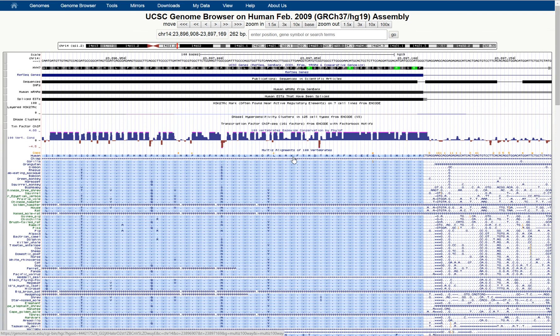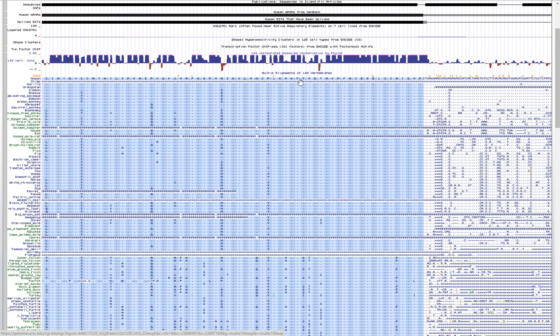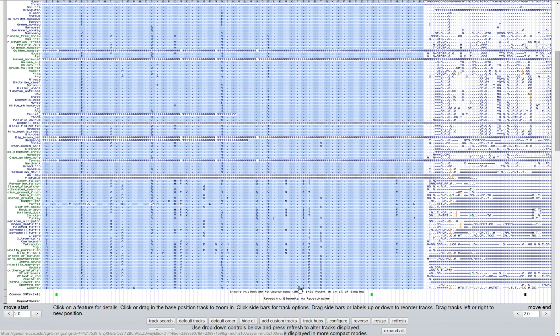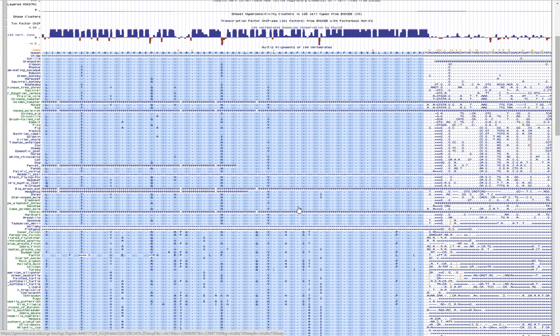What you see here is the specific amino acid location. It turns out the cursor tends to designate where the location of the variant is. Outside of this video, I confirmed what the sequence of amino acids surrounding the variant of interest was, and it sits in between a K and a T. If you look down — human is first — and you go through other species, you can see that this variant is very well conserved throughout mammals. There's not another species documented in UCSC, so you would consider this a highly conserved region and highly conserved residue.